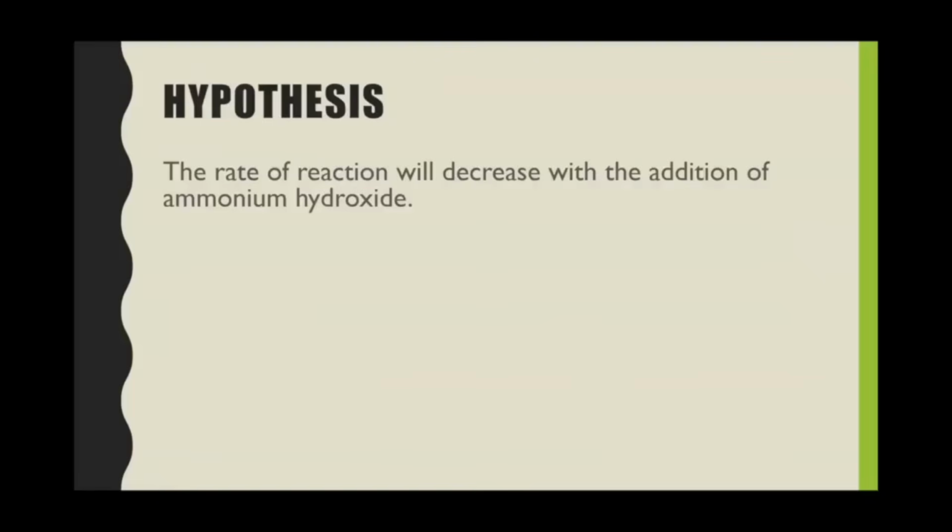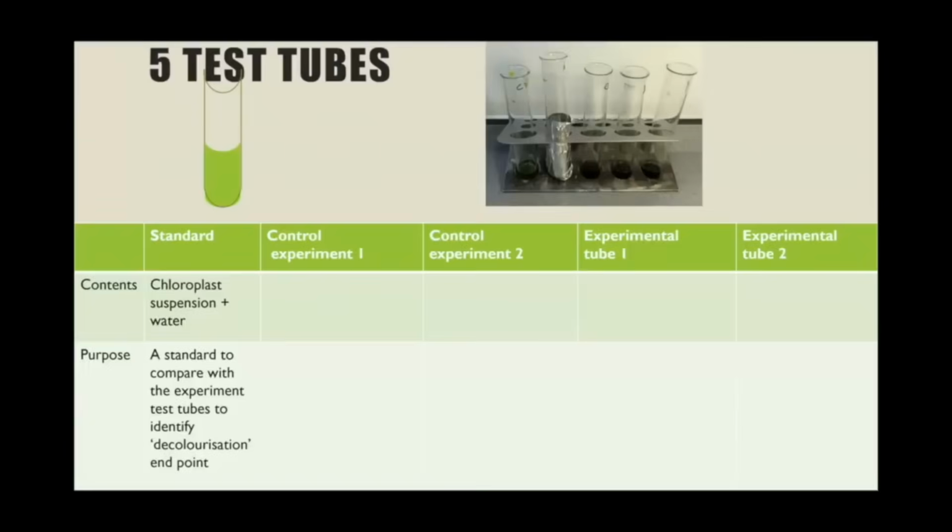And the hypothesis is a prediction on what we expect to find. So I'm going to be predicting that the rate of reaction is going to decrease when I add ammonium hydroxide, based on what we've just said in the background knowledge.